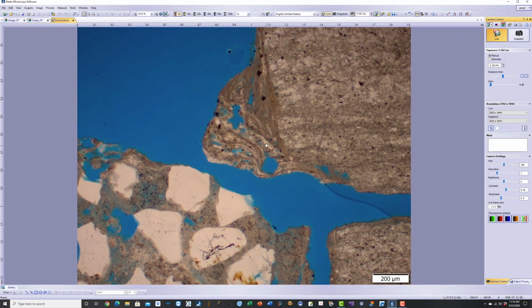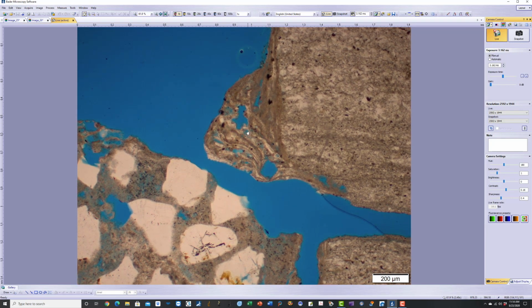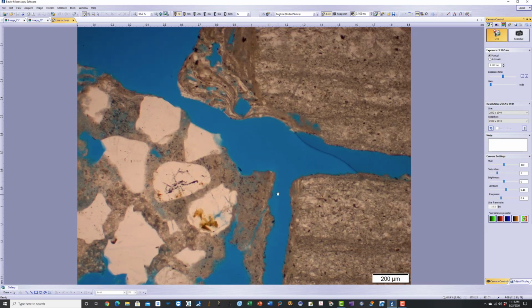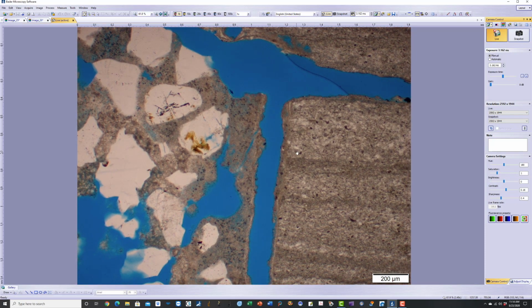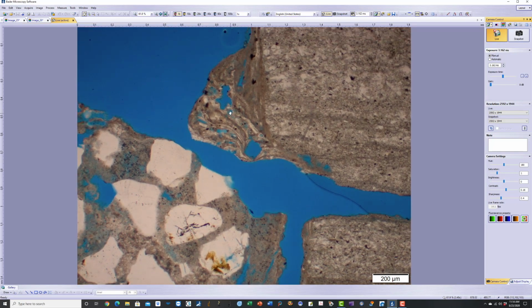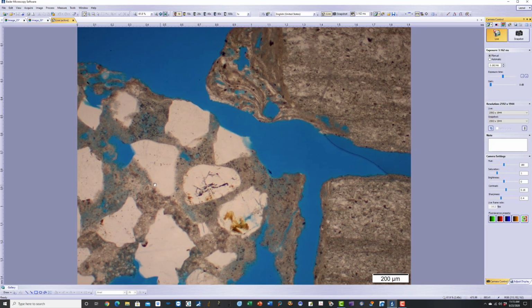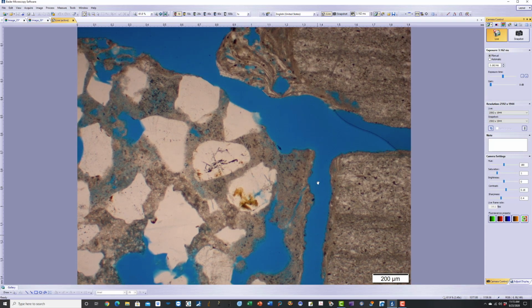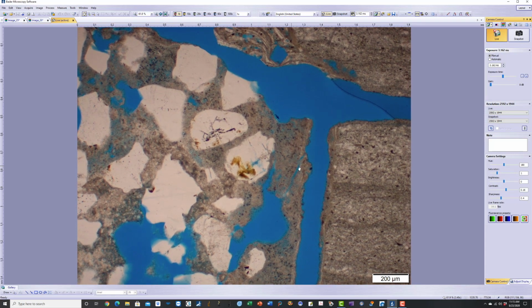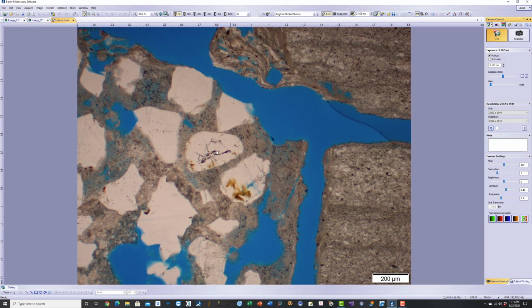This is a secondary calcite precipitate, secondary calcium carbonate, creating an efflorescence deposit on the stone. Usually these efflorescence deposits are found in the field at the interface between the mortar and the stone, where the ingredients of the efflorescence came from the dissolution of the cement hydration product of the masonry mortar, of the mortar joint. That dissolution by moisture entered through the interface between the mortar and the stone, caused dissolution of cement hydration product, mostly the calcium hydroxide component.